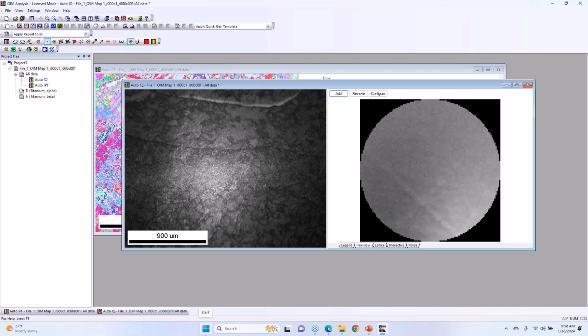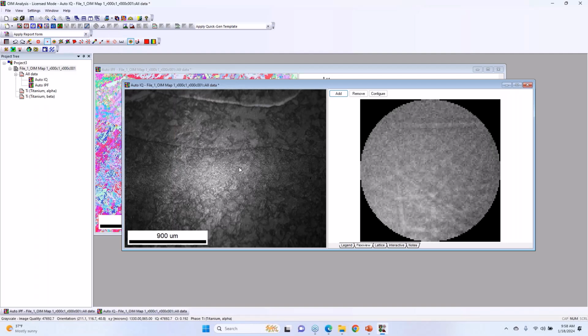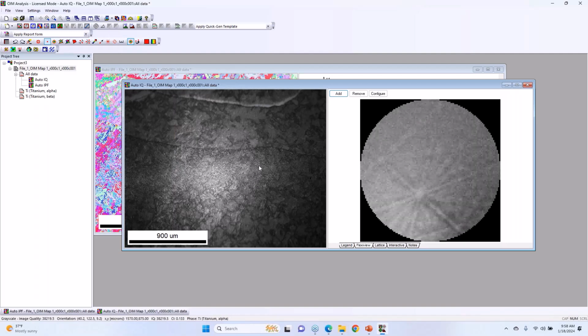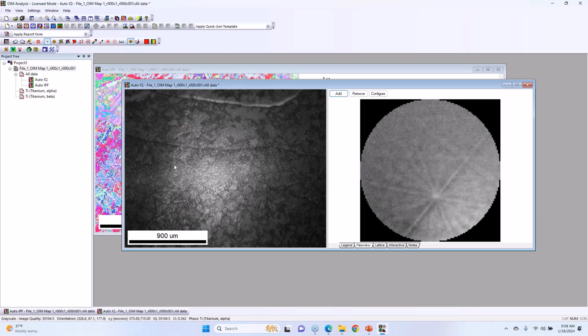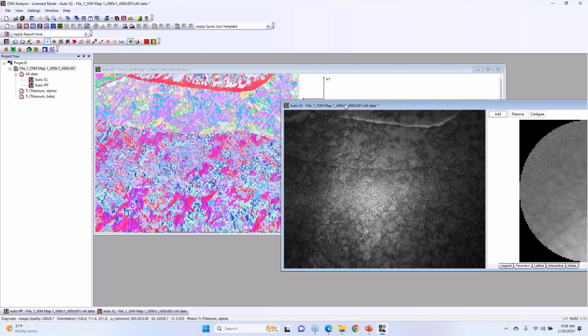So we have 2 different. I should make sure the question was, how do we set up a Montage? What parameters? When I look at this, I wouldn't want to run at this low of magnification, to avoid this beam intensity shift. So I would try to fit something so that it's a constant intensity. Now, if we look at the orientations, it doesn't really make too much difference. We're going to be able to index it.